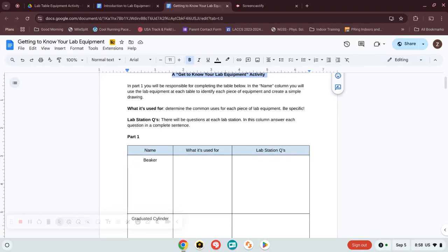Once you've done that, you'll be able to enter the lab, and you'll see at 6 of the 7 lab tables there are miscellaneous glassware, funnels, droppers, pipettes, hot plates, balances, all the tools you will use throughout this semester and next semester too. What I want you to do is walk around, check out all the lab materials, pick them up carefully, obviously, and take a close look.